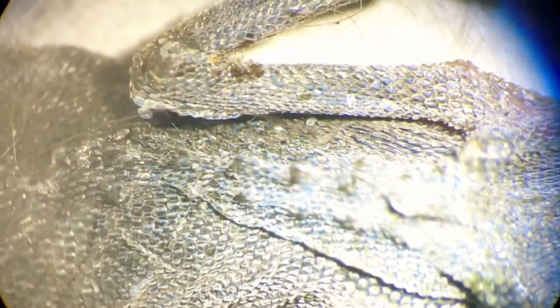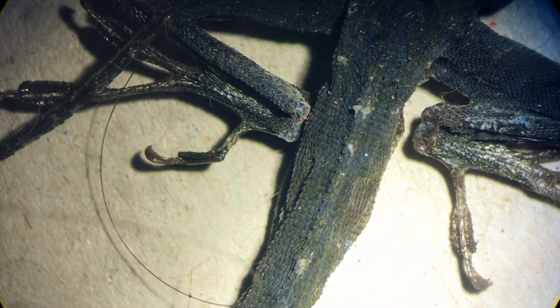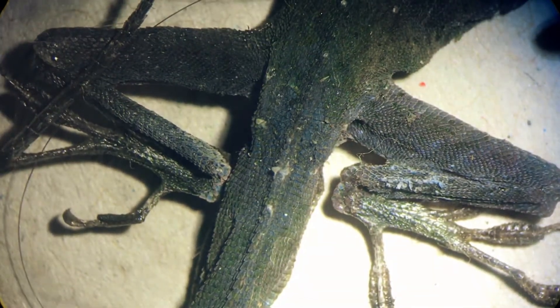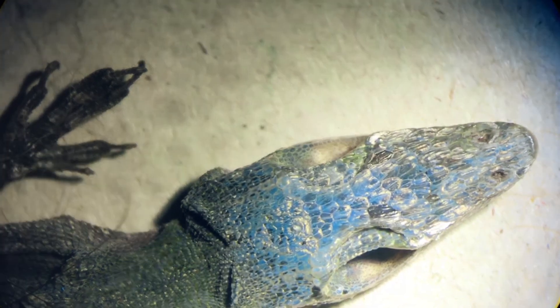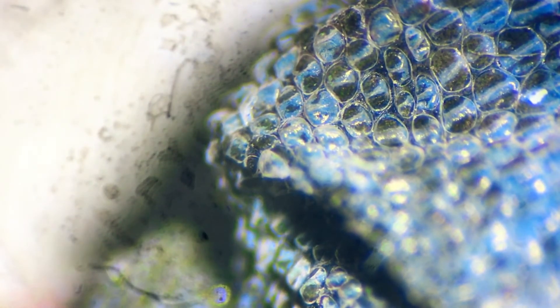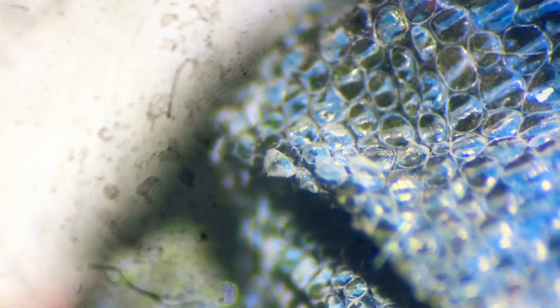Oh, that thing — you can see the ridges on his tail and whatnot, that's pretty cool. Well, sorry you died, lizard guy — nice to meet you. You can see the scales are pretty cool.